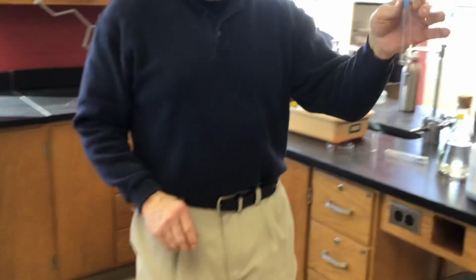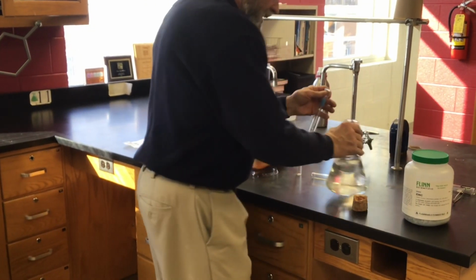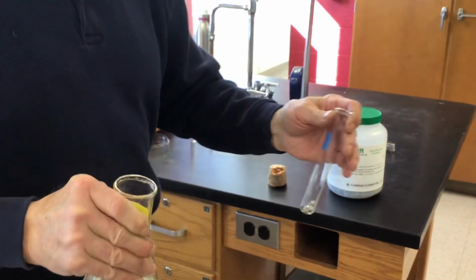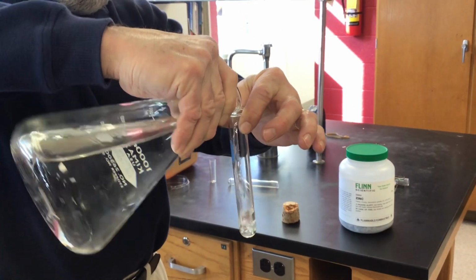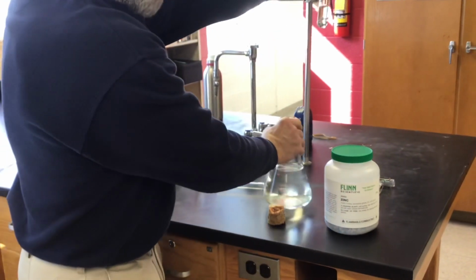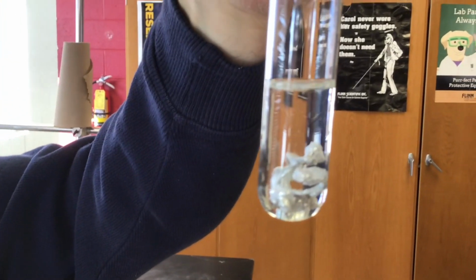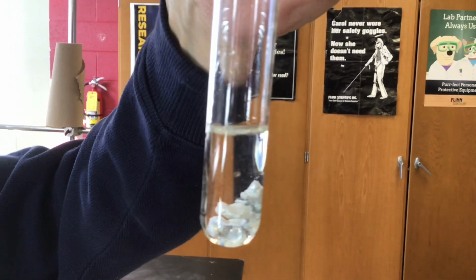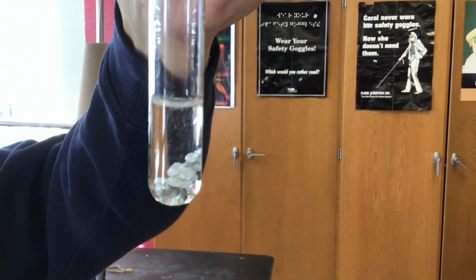I'm going to drop it in a test tube. And I'm going to add some hydrochloric acid. And you'll be able to see immediately something's going on there. I hope. Yep. I think it's happening. Not as quickly as we would like. Almost looks like there's a fish in there, too. You'll see that on the camera. That's crazy.